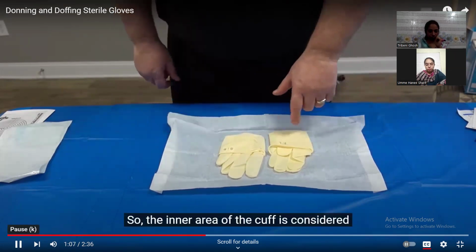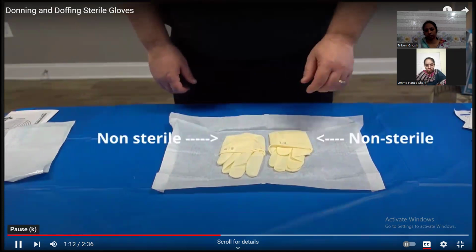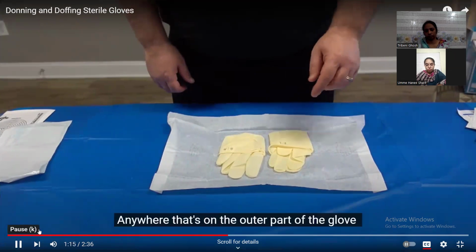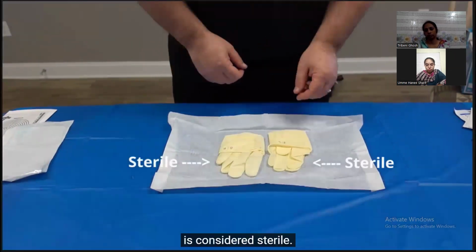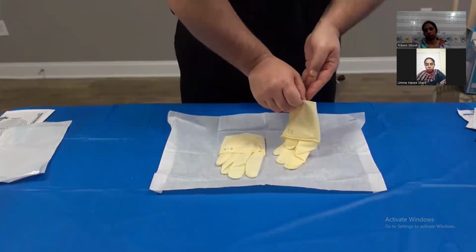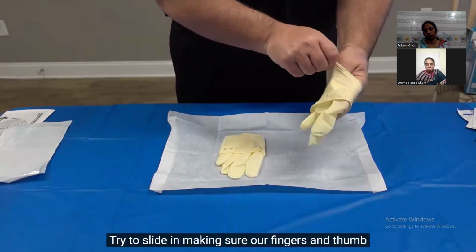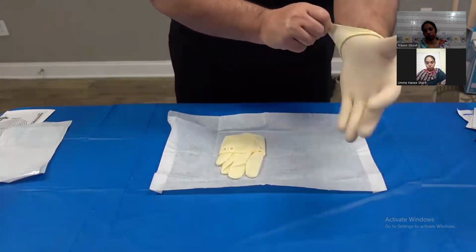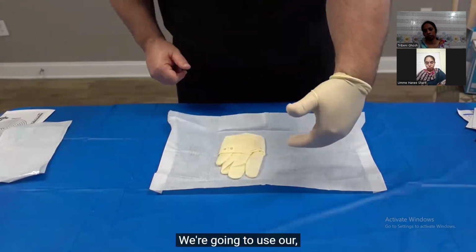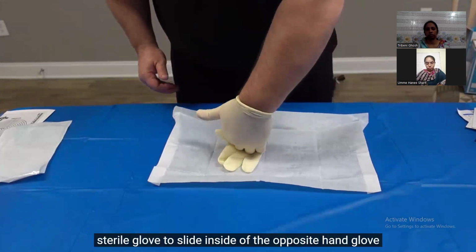The inner area of the cuff is considered non-sterile, so we can touch that. Anywhere on the outer part of the glove is considered sterile. Slide in, making sure our fingers and thumb get aligned properly. And we're going to use our sterile glove to slide inside the opposite hand glove.